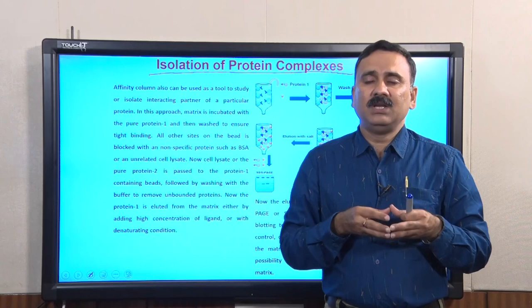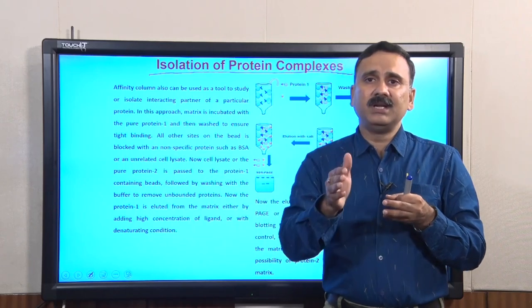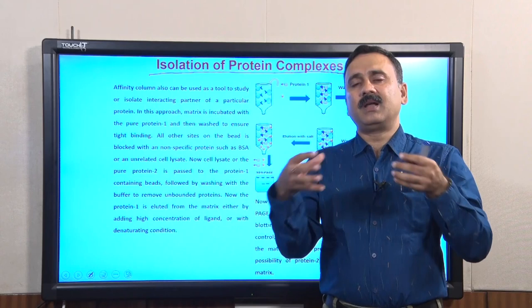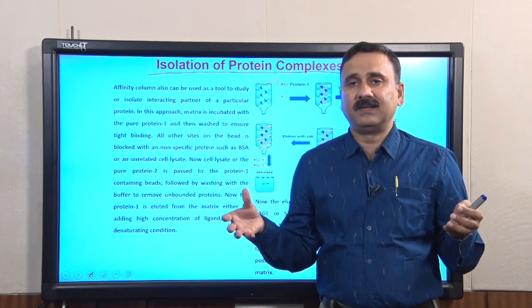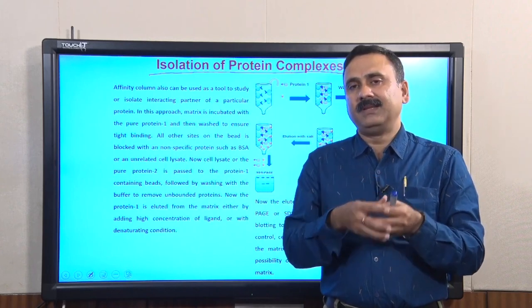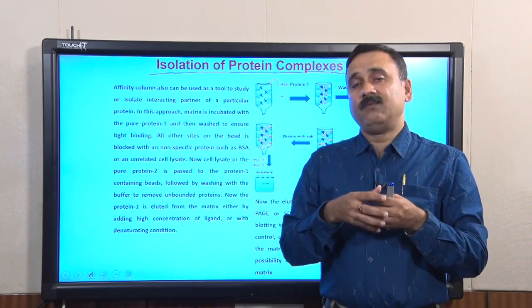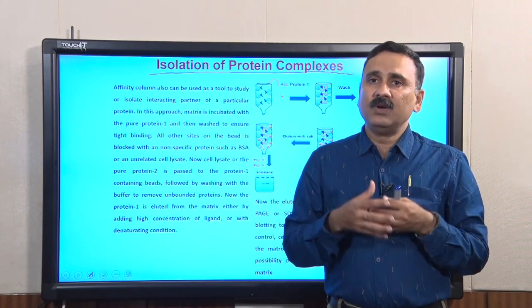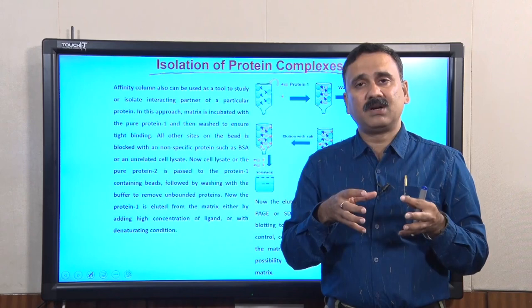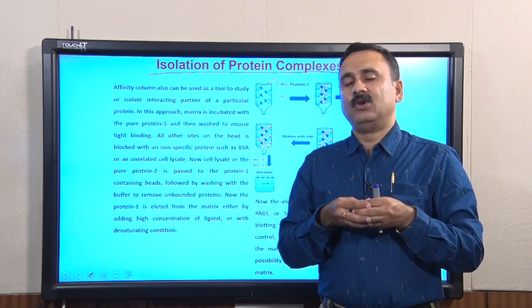So suppose you are working in your laboratory, and you are exploring this problem or a similar problem where you are stimulating a cell and looking for which proteins are binding to this receptor, or which proteins are coming together to make multimeric complexes, like the signalosomes which are formed when a B cell or T cell is under an active immune response, like against cancer cells or against an infectious organism. If you are exploring any such problem, then you can use affinity chromatography to isolate these bigger multimeric complexes, identify each and every protein, and answer many biological questions.